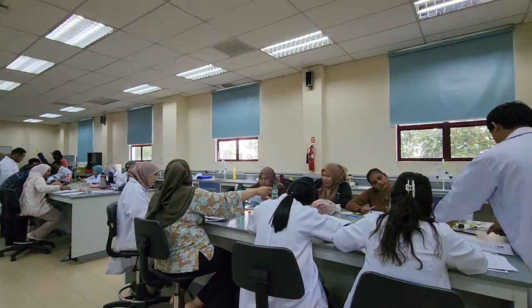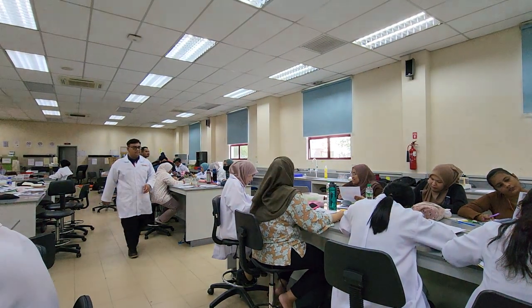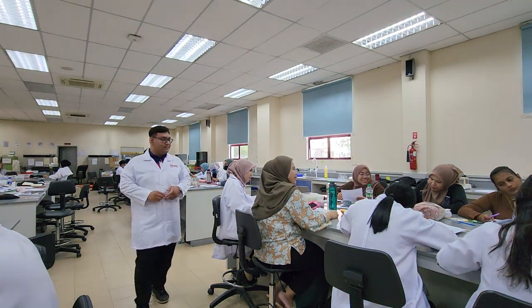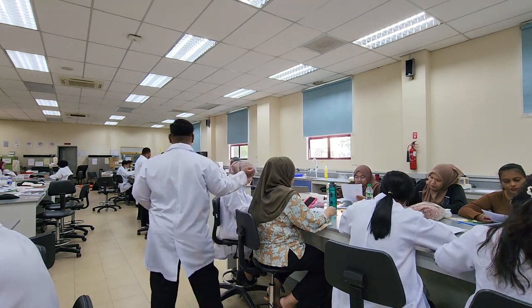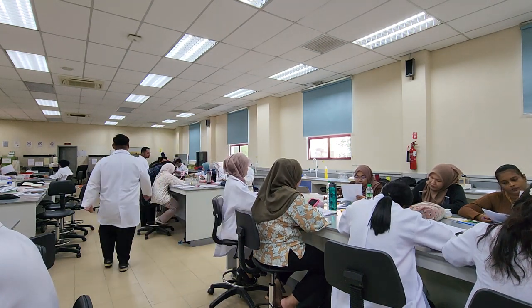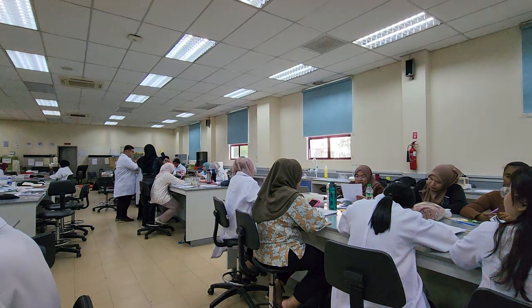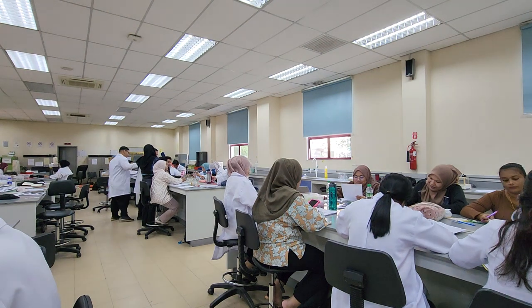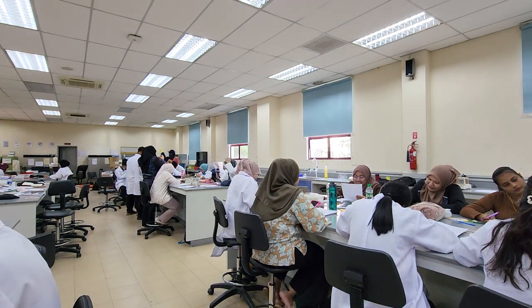Dia tak ada terabur macam tu. Nampak tak? Betul. Yang ni? Segitiga. Bulat tu. Nampak ni? Itu, ini adalah tangkai biji tu. So sebenarnya dia mula kat sini. Dan selalunya dia berdua. Tengoklah nota yang aku bagi dalam Skype tu. Penat aku bagi. Keliling perai tu.